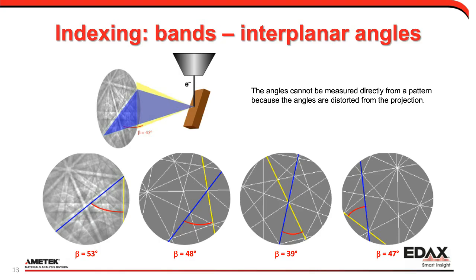Most of your systems aren't at a full 90 degrees. Most are slightly tilted to help with space issues or solid angle issues or things like that. And that's where we're very happy to have our mechanical engineering group do their hard work of optimizing those port covers and drawings. So again, these angles aren't going to be exactly what you're measuring. They're going to be based on the projection.